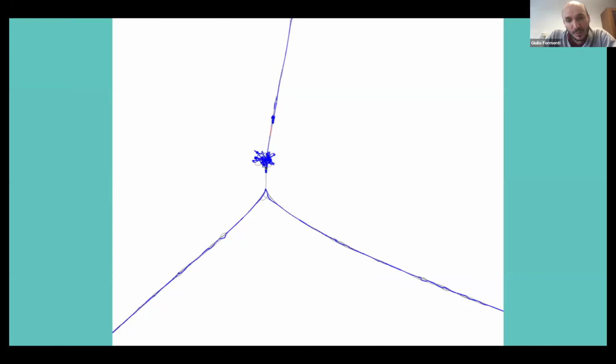What we can see is the gray ones here, they basically spell out alternative paths that exist in the raw reads, but that are not in our reconstruction. Now, this could be just sequencing errors. In many cases they are, but in other cases they may actually suggest alternative paths that would fix errors in the assembly. So for instance, this is a more obvious one.